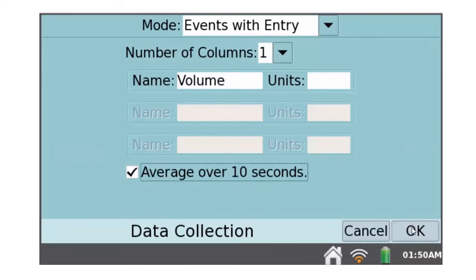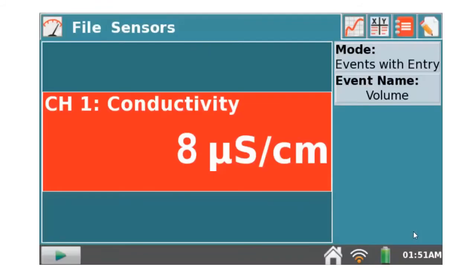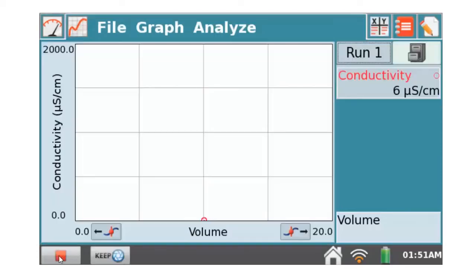It looks like that. You click on your okay down in the corner. Tell it you want to average over 10 seconds. Tell it okay. You've done that before. Now you're set to go.